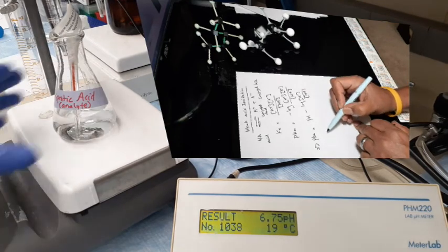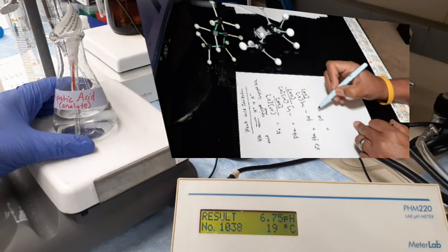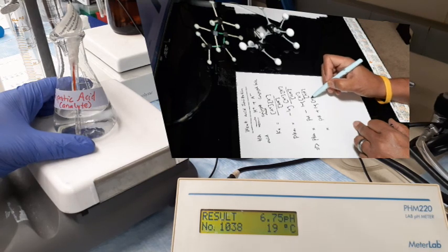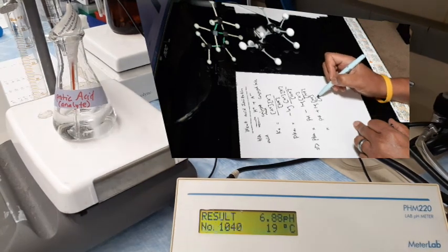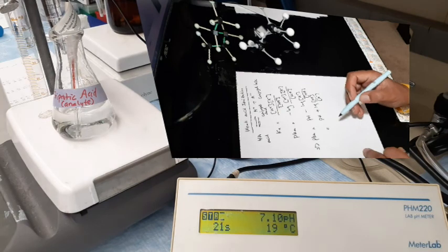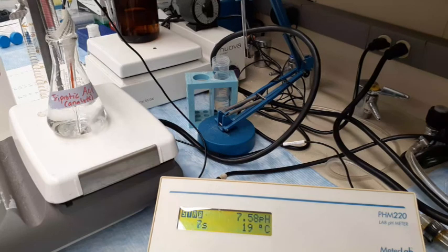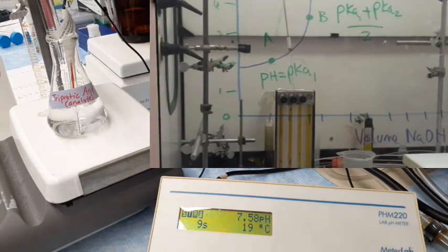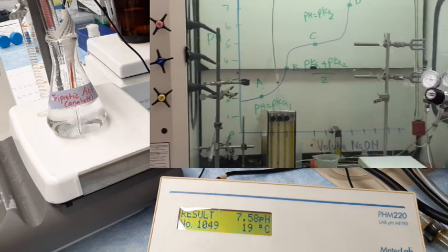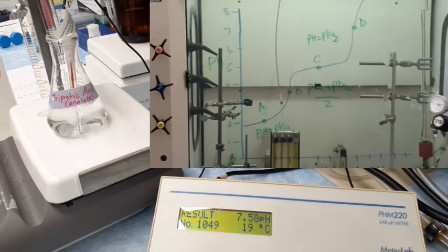So now the titration is progressing well, and I have added already 44 ml of sodium hydroxide, and the pH is 6.75. Now we are going slowly to the basic region of the titration curve, because we are more than pH 7, which is 7.58 at 54 ml of sodium hydroxide.